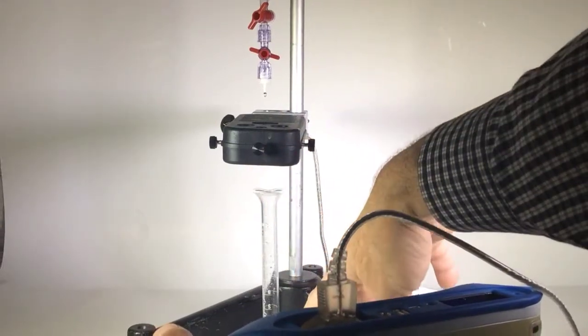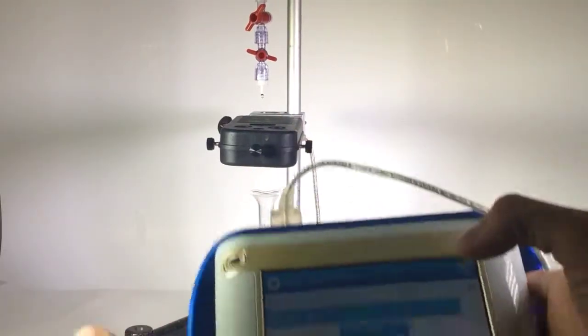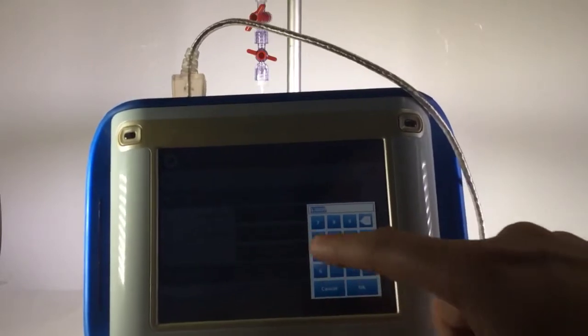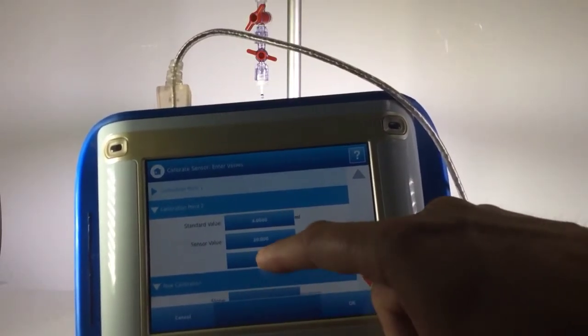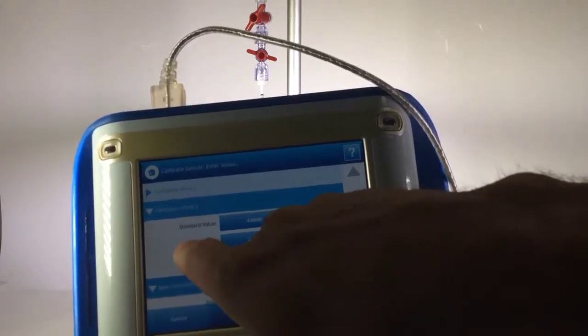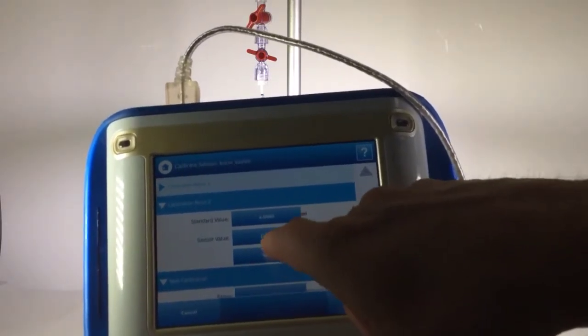I can read the four. I don't think you can. So what I'm going to do is type in four milliliters, OK. And then I'm going to hit read from sensor. Now the sensor value changed to 212.